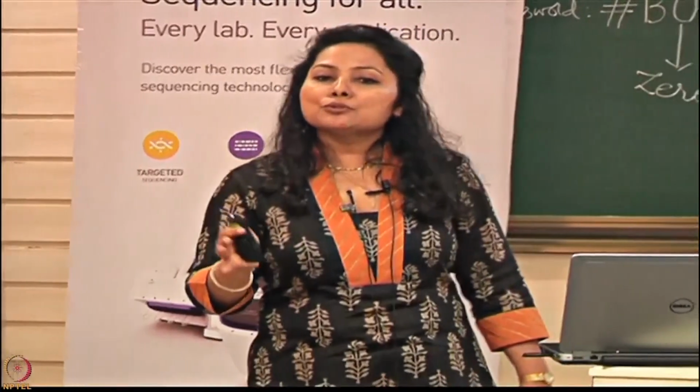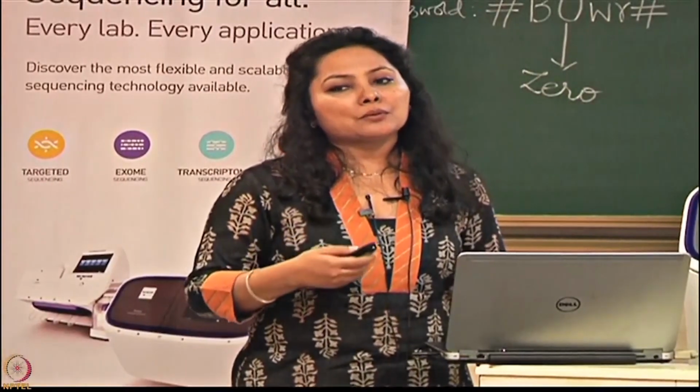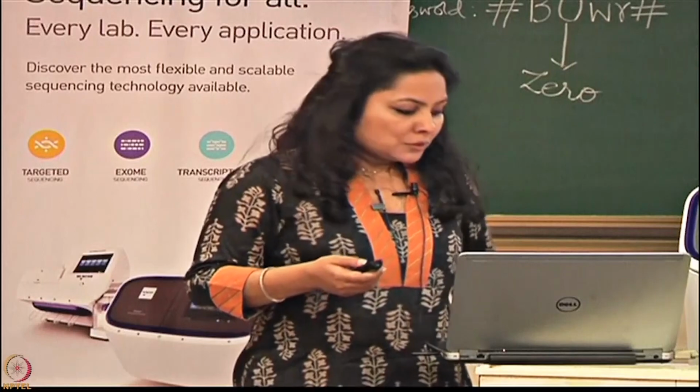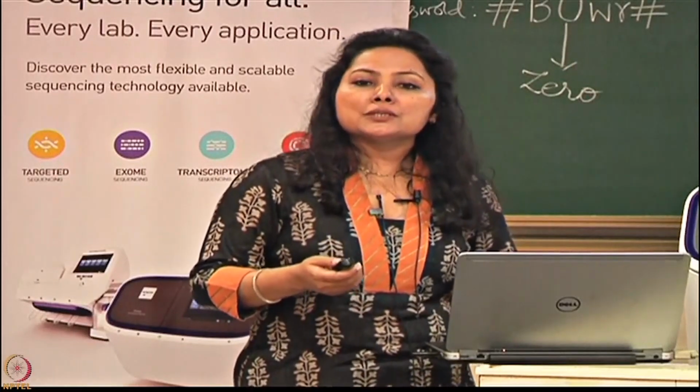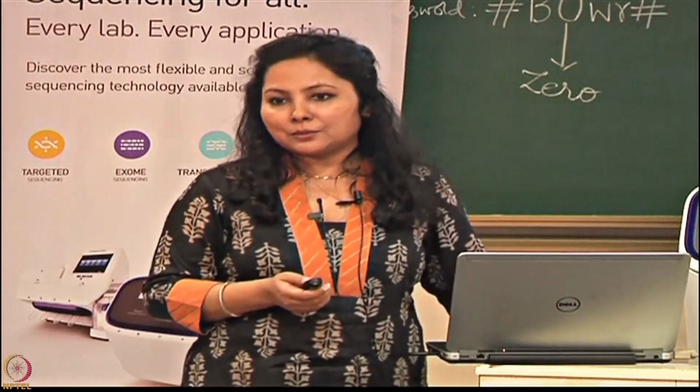Suddenly, somewhere during 2004, 2005, we started hearing about next generation sequencing. So if I were to talk about next generation sequencing, it is more aptly called massively parallel sequencing.